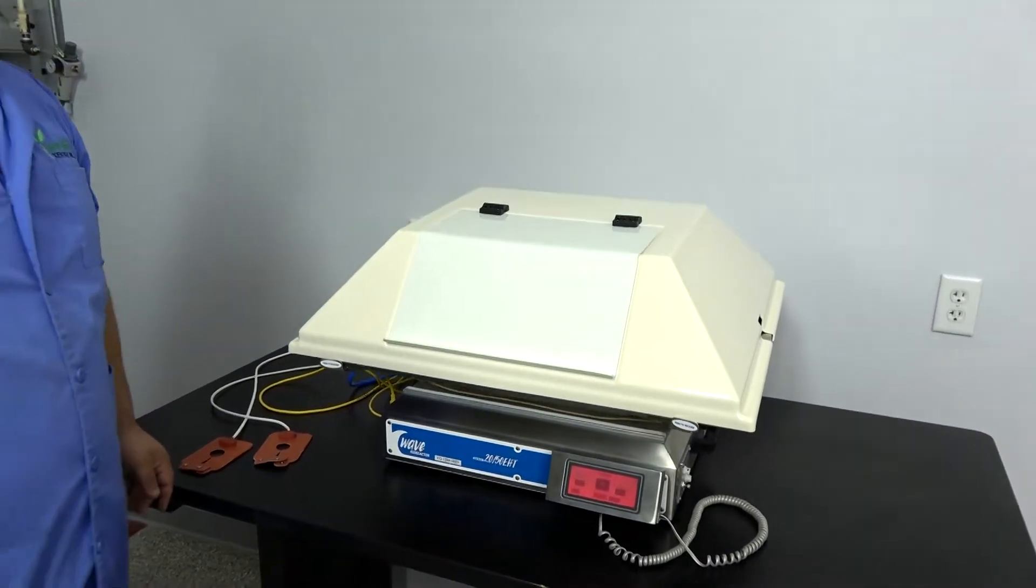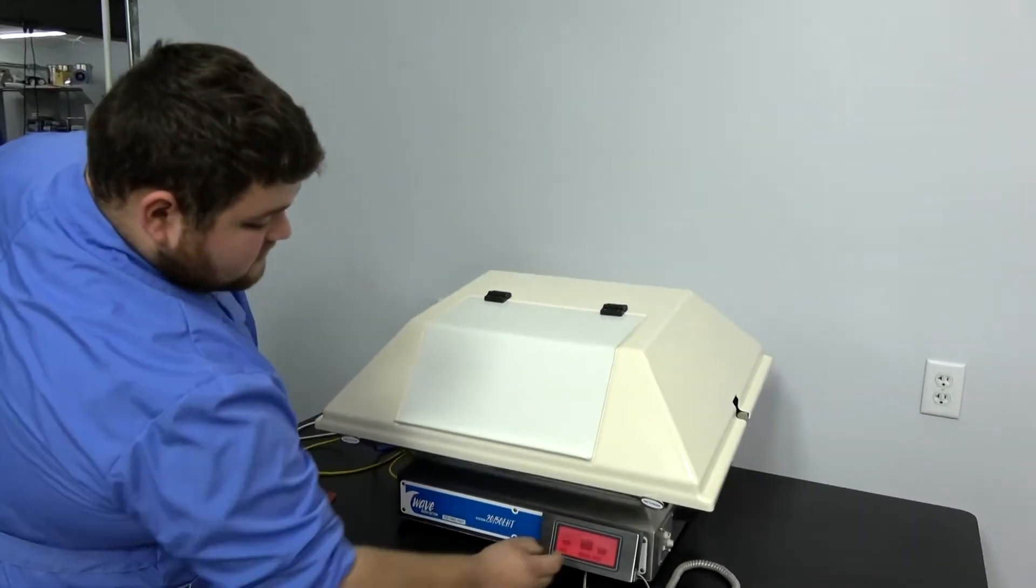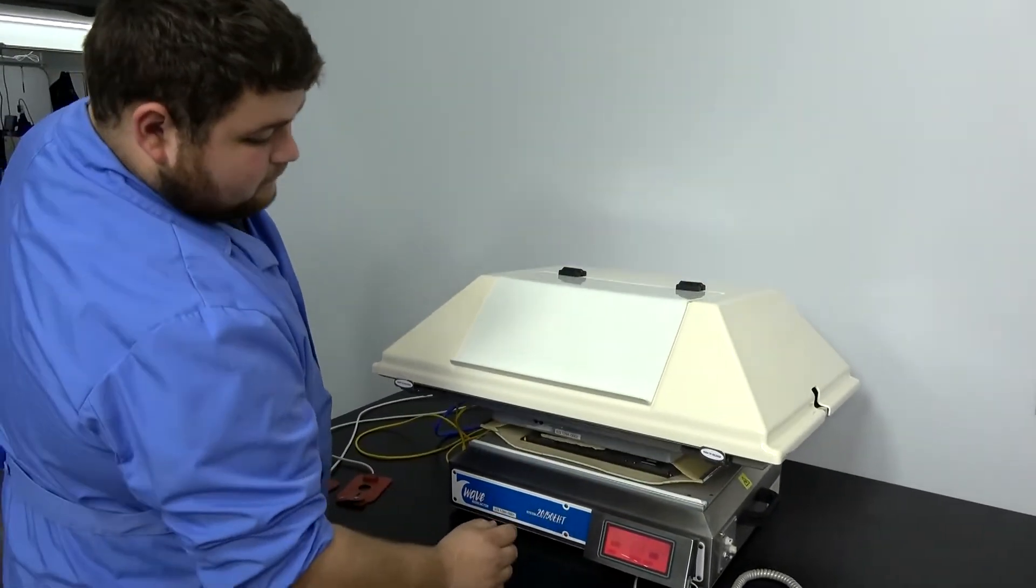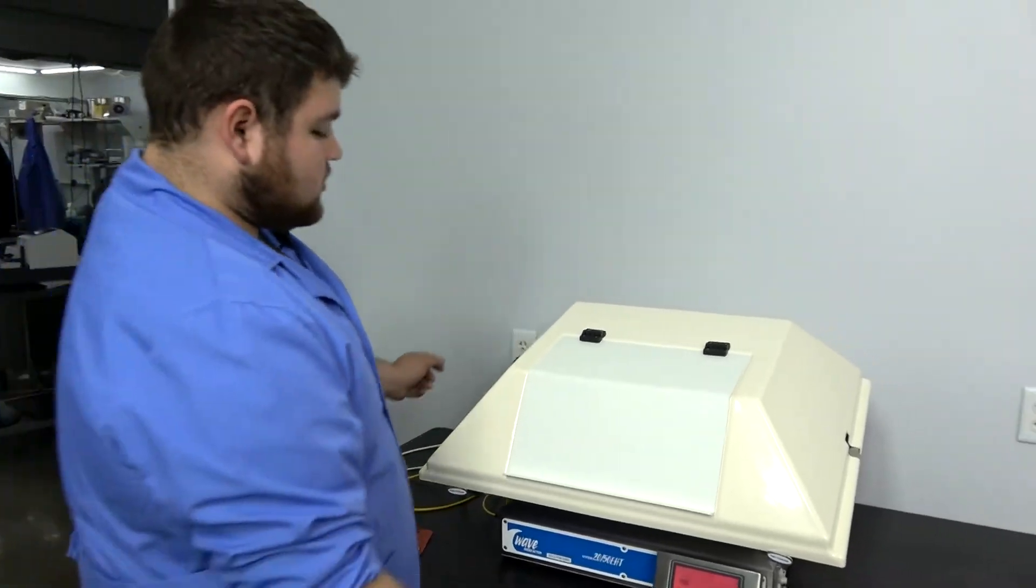This unit is capable of doing a 2 to 20 liter bag. I'll stop her right now for you. And she always comes down to the stopped position.